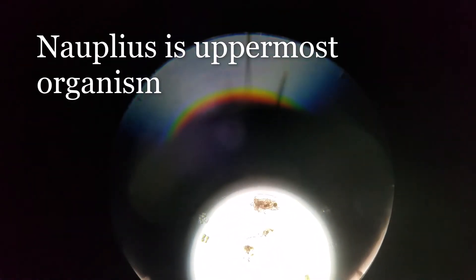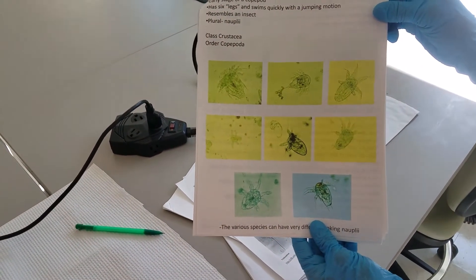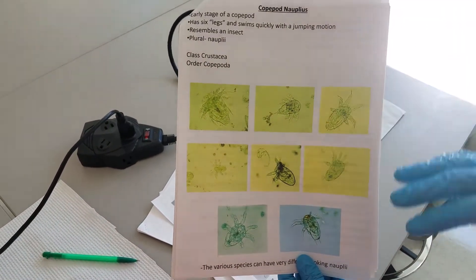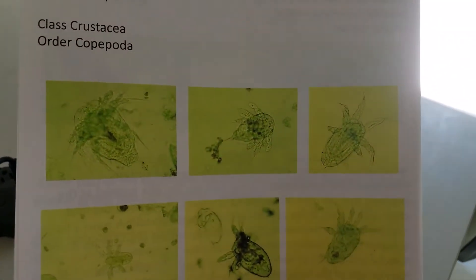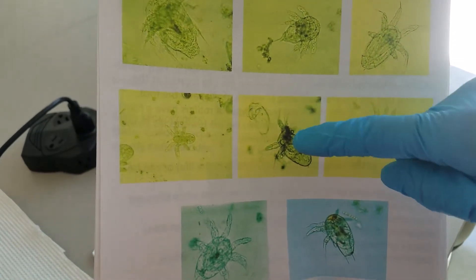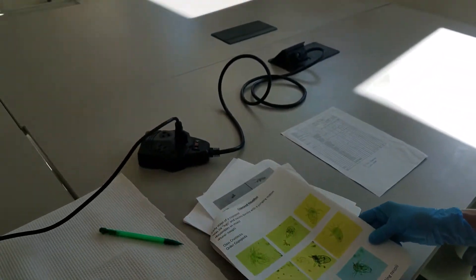You can see the little legs and all — that's a nauplius. We have an ID guide that we use to help us determine what these organisms are. In the ID guide you see lots of different orientations of nauplii — full frontal you can see all the legs, but in this case it's sort of scrunched to the side. I'm still seeing the little appendages that clearly distinguish it as a copepod nauplius.